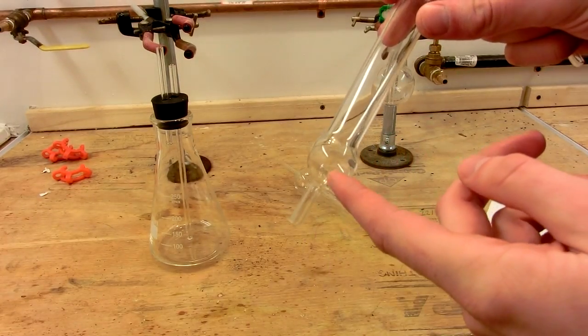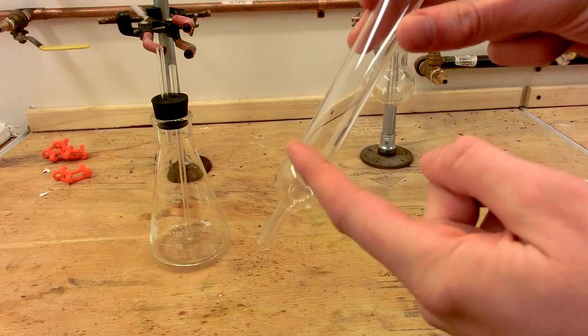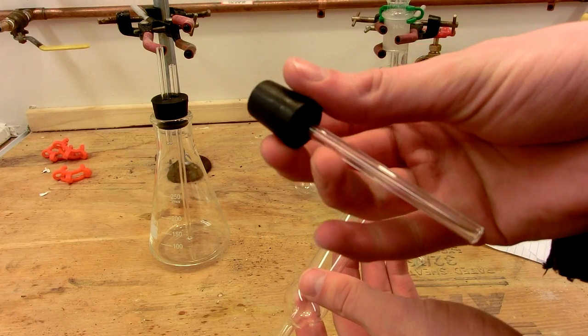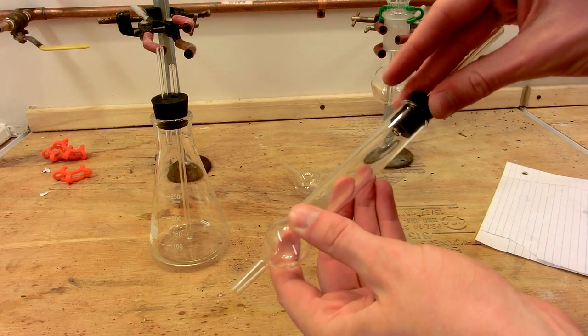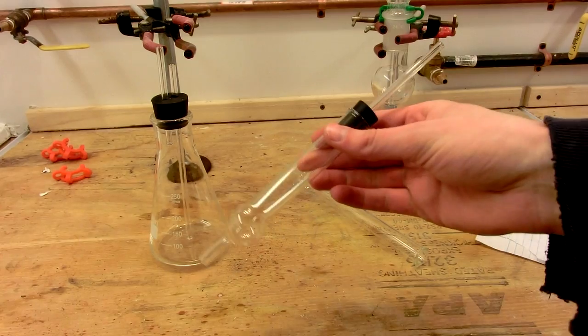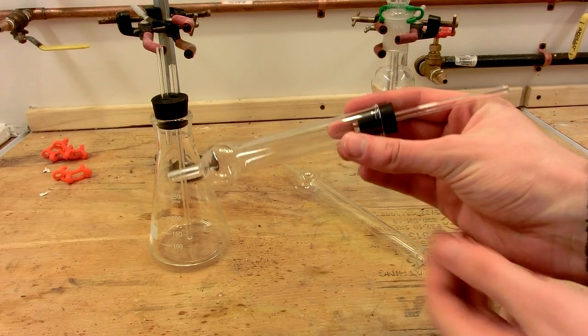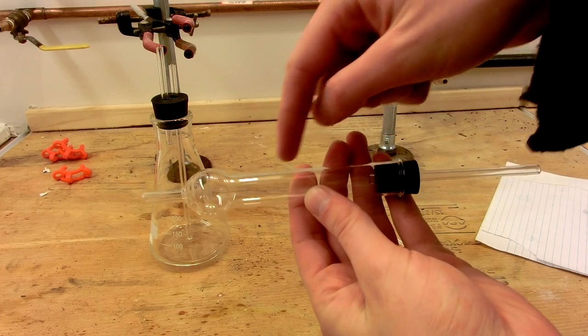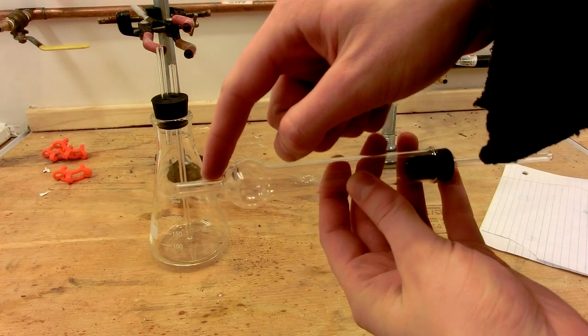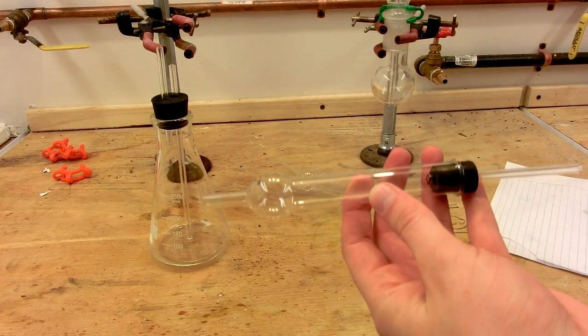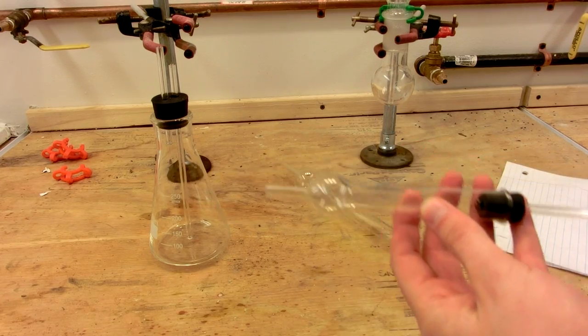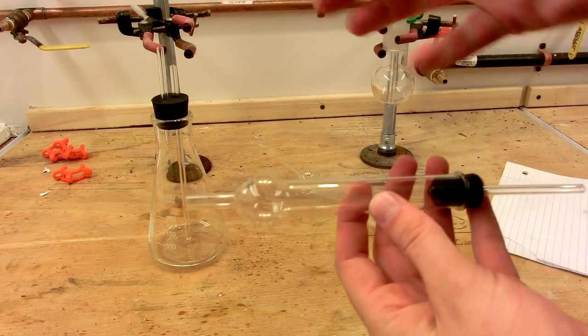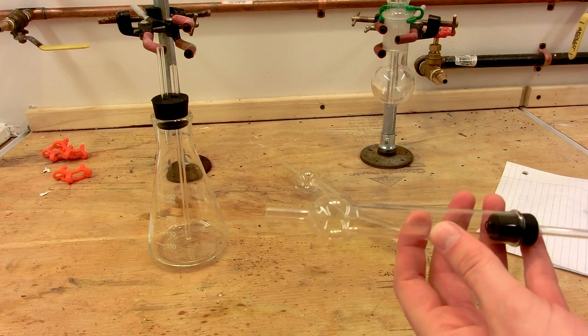The solid desiccant would be put in on top of the glass wool, where it would sit, and the glass wool would prevent it from coming out of this tube down here. And then a stopper with a piece of glass tube through it would be inserted into that end, and that completes the drying tube. So essentially what happens is gas comes in through this tube and then runs through the desiccant, where the desiccant absorbs the water from the gas, and then the dry gas comes out there and can be used for an experiment through a suckback trap, preferably, so that none of the experiment gets sucked back into the drying tube in case there are fluctuations in pressure in the apparatus.